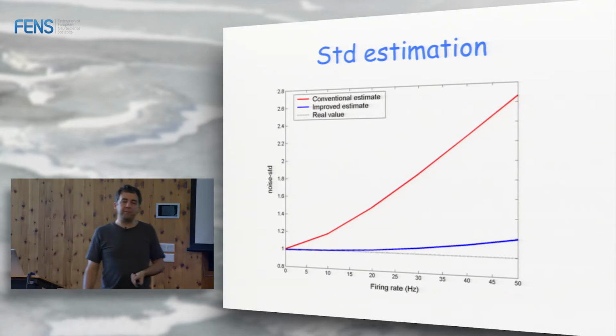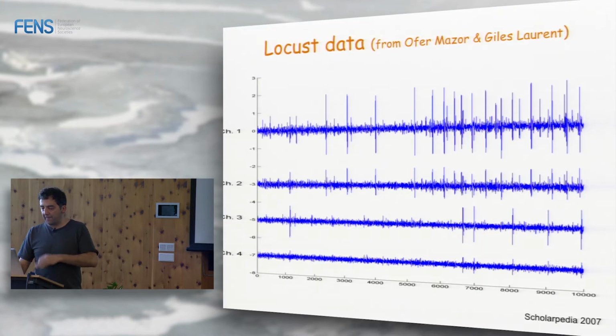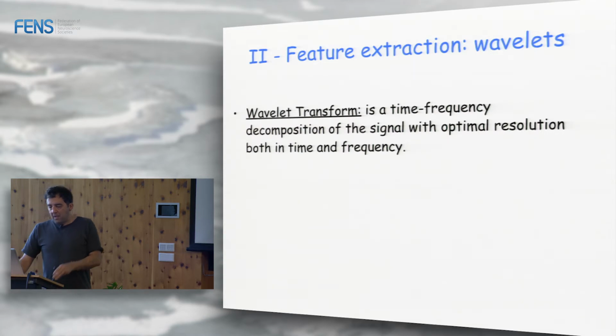So it's a very simple trick. So we have 2 tricks so far. Use non-causal filters, and use an estimation based on the median to set the threshold. All these tricks are already implemented if you want to use our codes, but I just want to tell you all the steps that are there. So I skip that, we don't have time.